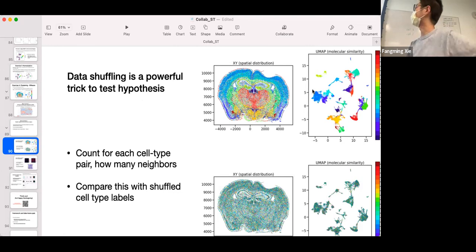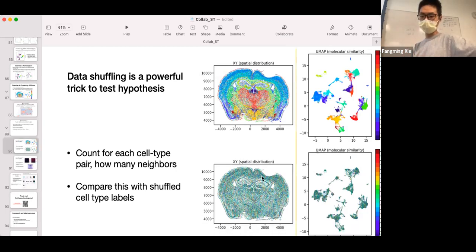You know how to get to this point, make a cluster and know where each cluster is. So then once having that, you can just count for each cell type what their neighbors are, and you arrive at a matrix for each pair of cell types, how many connections locally do they have? So the question is, are those cell types enriched, or is that frequency more than random? So how do you create a random? You just reshuffle your cluster assignment of each cell randomly.